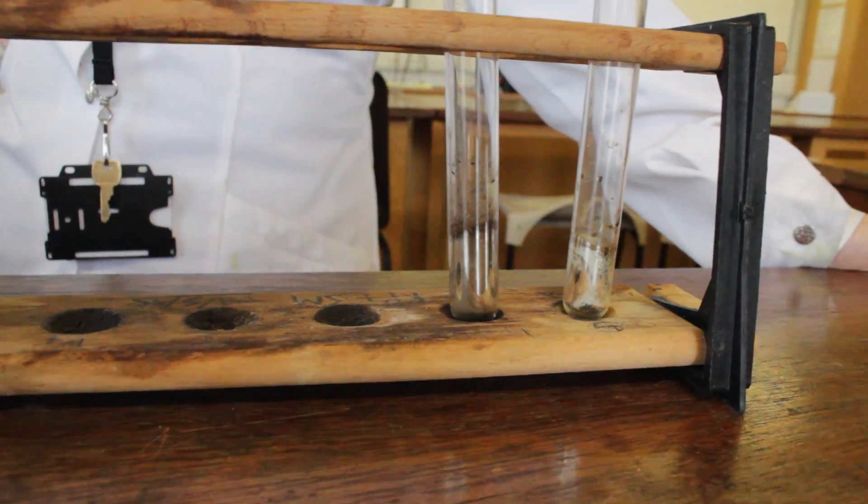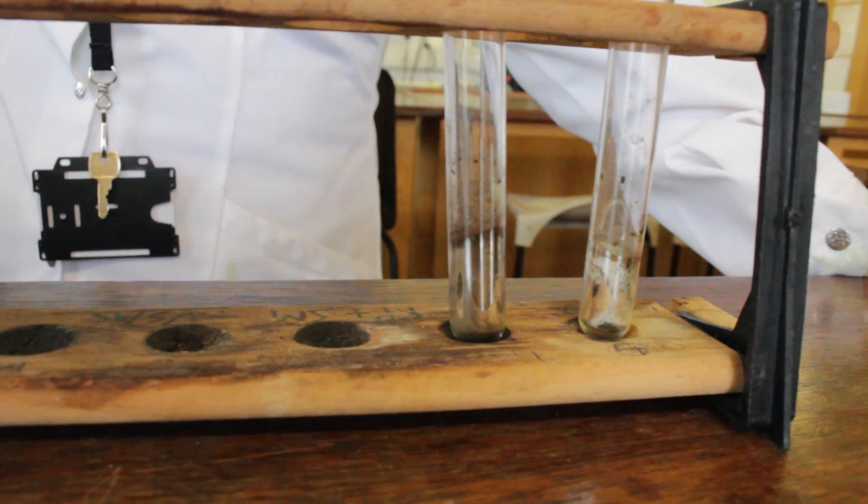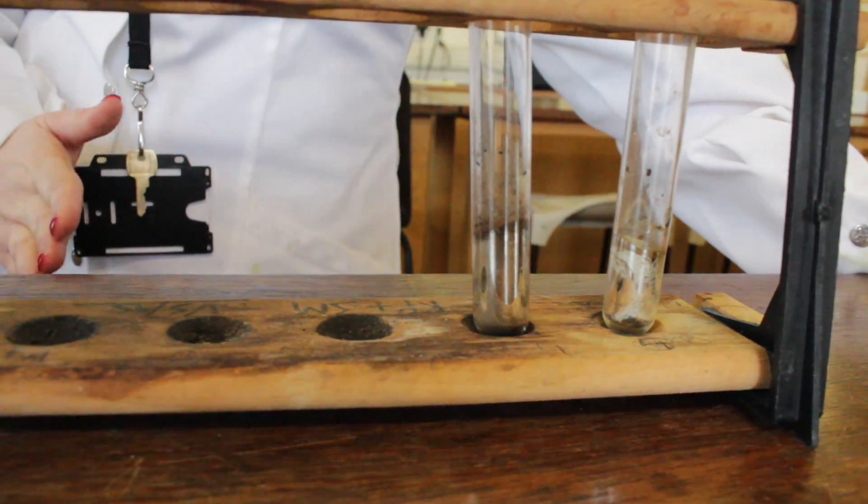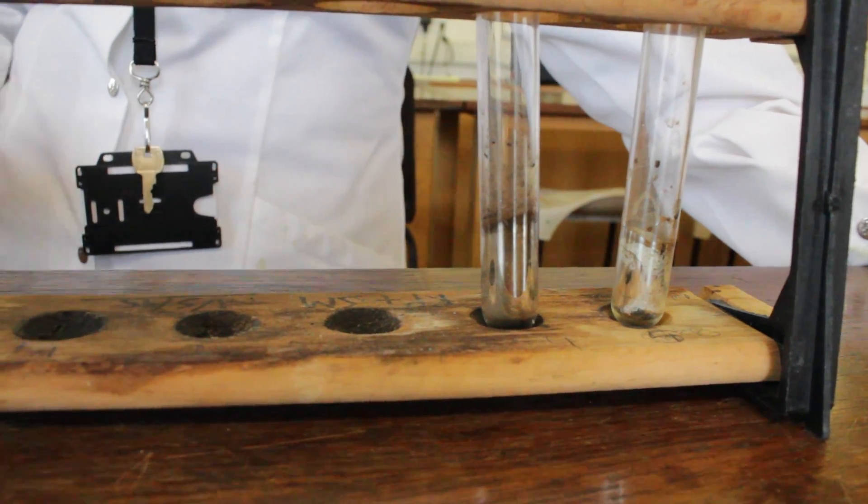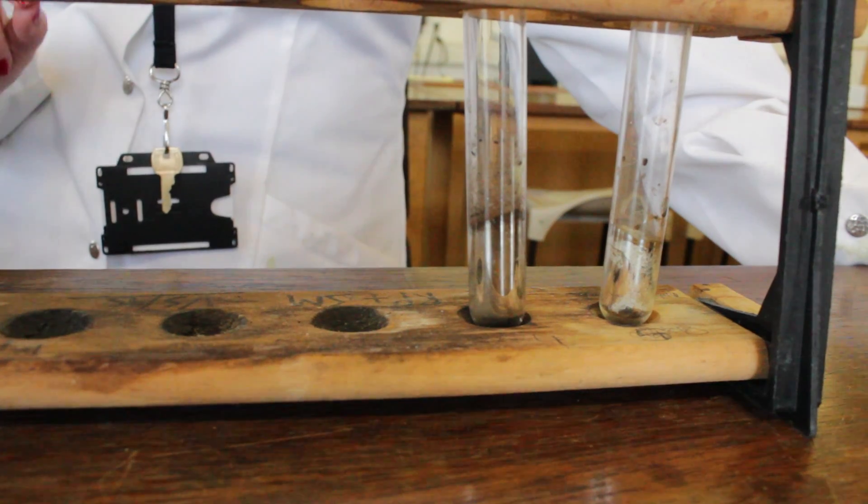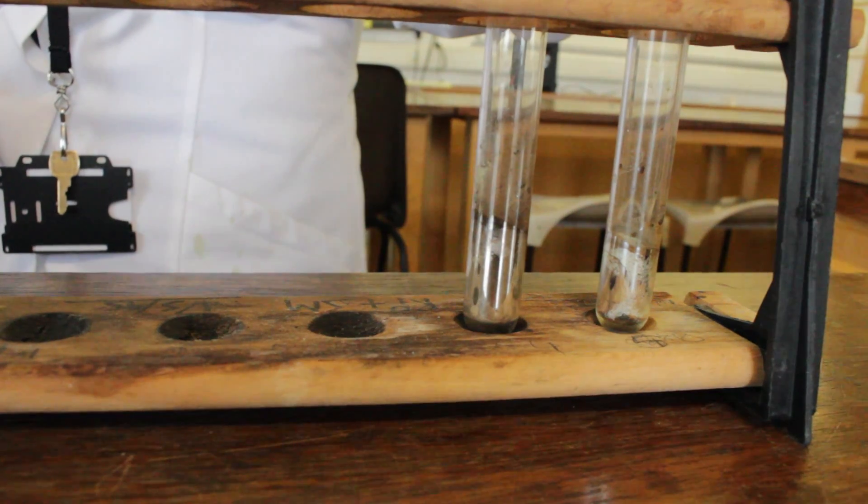The test we're doing today is the silver mirror test. It's a test used to distinguish between two carbonyl compounds, either an aldehyde or a ketone. Today we are going to use an aldehyde which should give us a positive test in which a silver mirror forms around the side of a test tube.